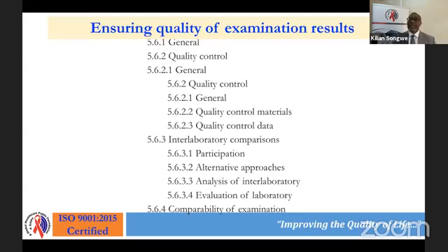So the quality control material would allow you to say, should the quality control material be positive, any other patient on that 96 well plate that shows the same reactions like the quality control would also be positive. So if you're using the PCR and it has coloration, so there is a change in color, if your controls suddenly became yellow, and then you found in any of the other wells a yellow sample, it means that sample has responded like your positive control, therefore saying that that sample is positive. Your negative controls will be clear. If your negative control is clear, any other sample in any of the wells that comes out clear is going to be deemed as negative. So literally, the quality control becomes really crucial, because you are actually saying this is the standard and everything else is compared to the standard to be able to determine what that result is going to be.